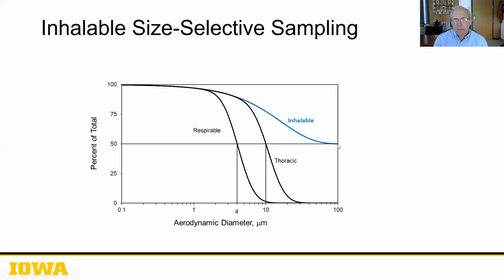So this is suggesting that of 100 micron particles, about 50% of them will enter our mouth. The other 50% just don't get in there. And above that, it drops off quickly. They're basically falling past our face because they're so heavy at that point, and we're not sucking them in. But it goes up rather quickly to 100% efficiency for the very small particles.